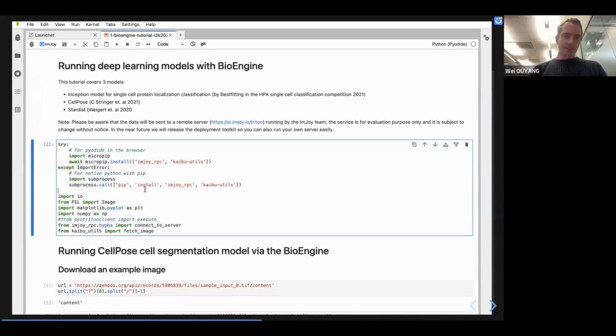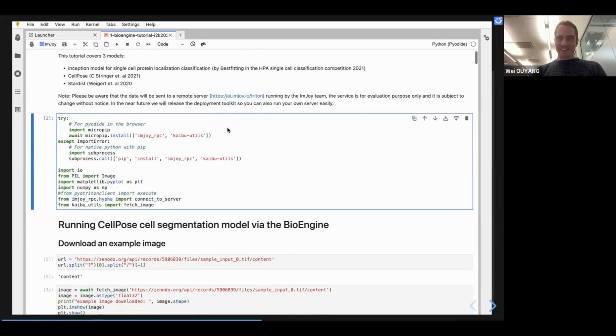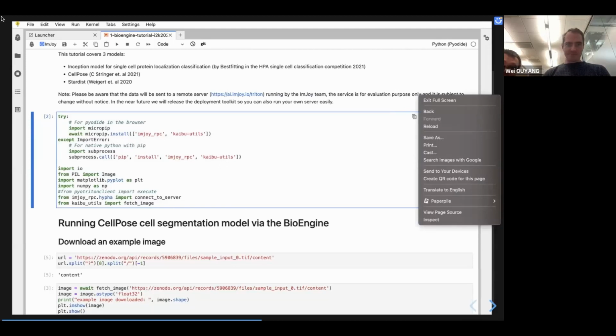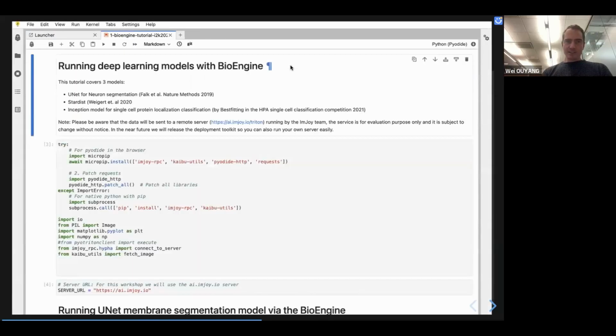So as you can see, this is written to run both on... I think you will need to reset. I think my browser cached. You've cached it. Yeah. So, sorry about this. There you go. So that's a good reminder for anyone who does anything in the notebook that they don't like: if you scroll up to the top of the page, you can always press the reset button, and that just refreshes to a basic version of the notebook again with no changes.